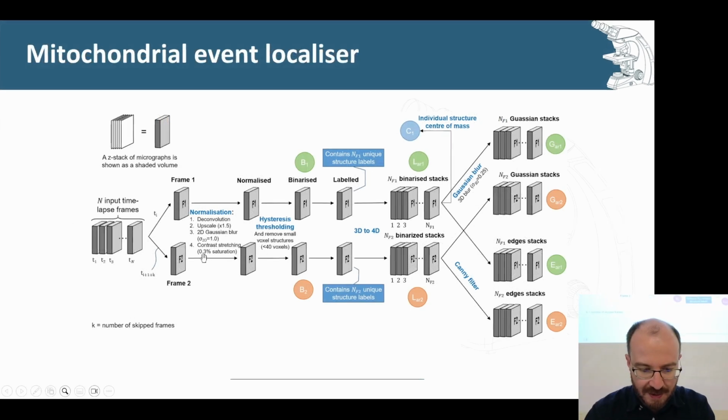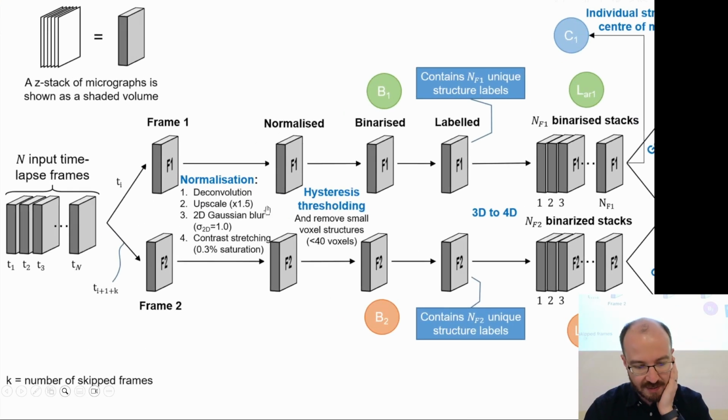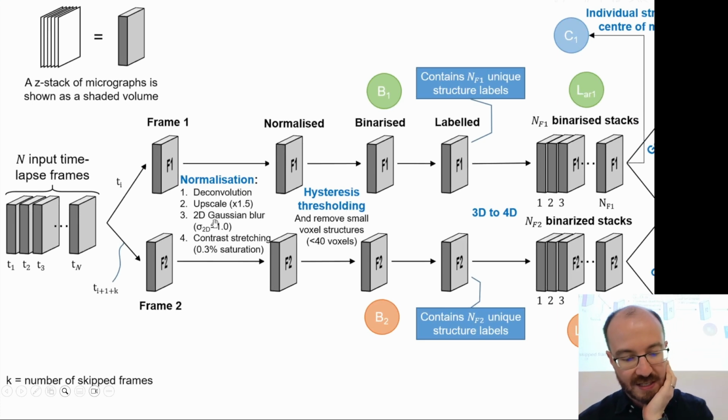So this was the initial version of the pipeline. I'm just mentioning things. I'm not going to discuss them in depth, just show some of the reasons for it. So first do deconvolution, then we upscaled it a little bit.